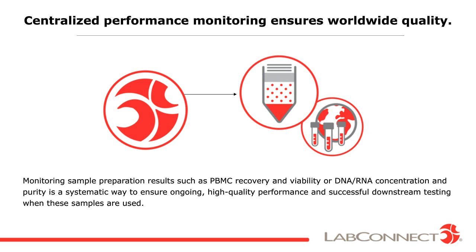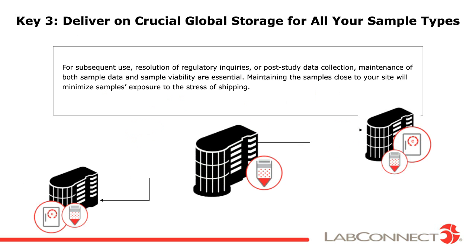The third and final key to success is ensuring proper storage for all samples and data after the samples are processed. It's critical that once processed, samples remain at the appropriate temperatures for storage. If samples are being frozen for long-term storage, consideration of storage space and location should be established before the samples are actually processed. In this section, we will evaluate backup requirements, space and freezer requirements, and security considerations.